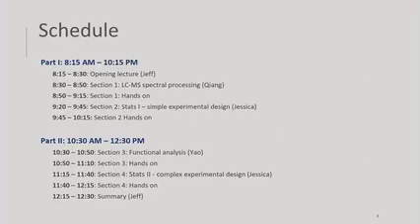So here's the schedule, and you can see it's full. The first 15 minutes is the opening lecture about the general concepts in data analysis and the design overview of MetaboAnalyst. Then the next one is going to start with LCMS spectral processing.